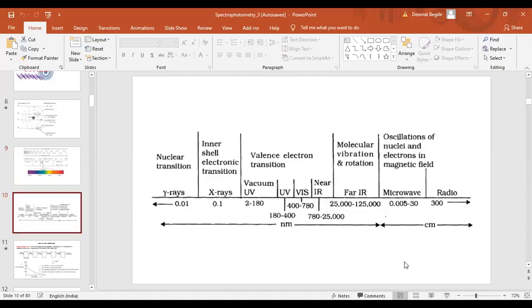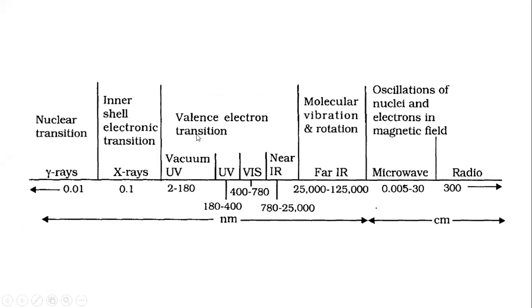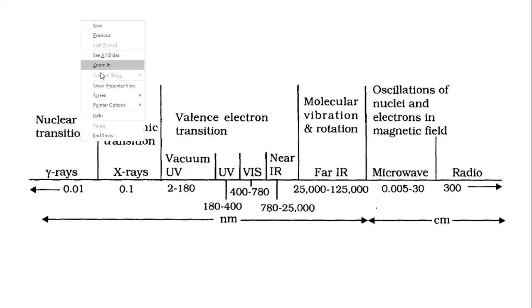Okay, to give you a clear picture, this is the slide that can tell you more clearly about what actually is happening. The highest energy radiations, we talked about this in the last class, but I'm just giving you a small summary of it. The highest energy radiations are gamma rays. The wavelength is the least, as we know that there is an inverse relationship between energy of light and wavelength. So higher the energy, lower is the wavelength.